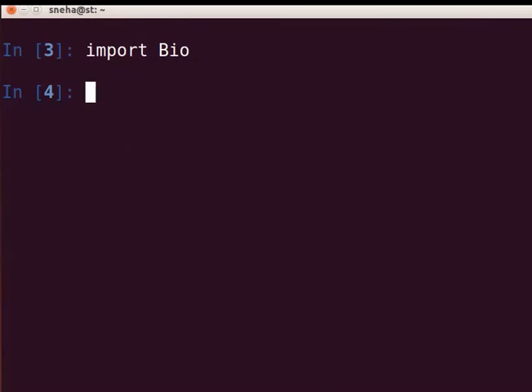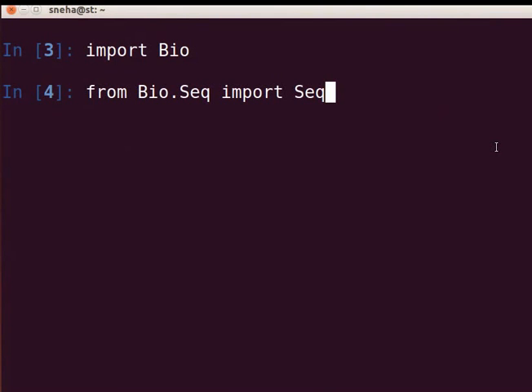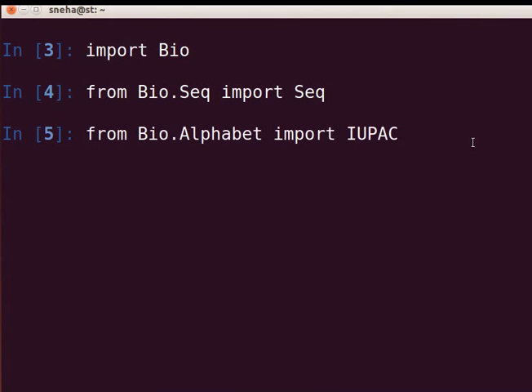The first step is to create a sequence object for the coding DNA strand. Let us go back to the terminal. For creating a sequence object, import the Seq module from the Bio package. The Seq module provides methods to store and process sequence objects. At the prompt, type 'from Bio.Seq import Seq' and press Enter. Next, specify the alphabets explicitly when creating your sequence object — that is, whether the sequence codes for nucleotides or amino acids. To do so, we will use the IUPAC module from the Alphabet package. At the prompt, type 'from Bio.Alphabet import IUPAC' and press Enter.